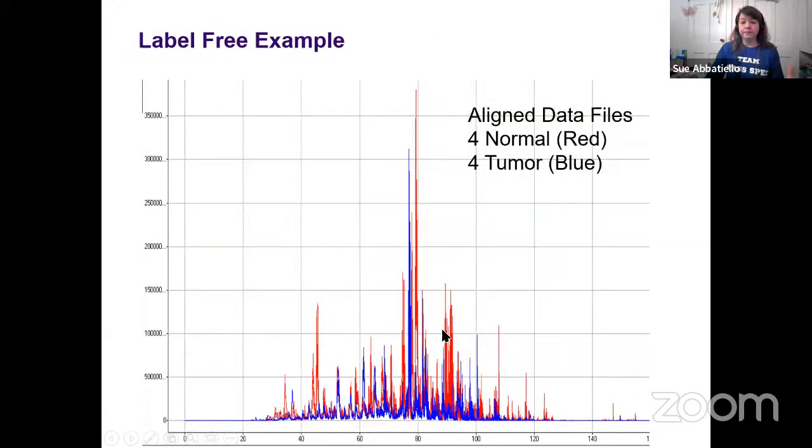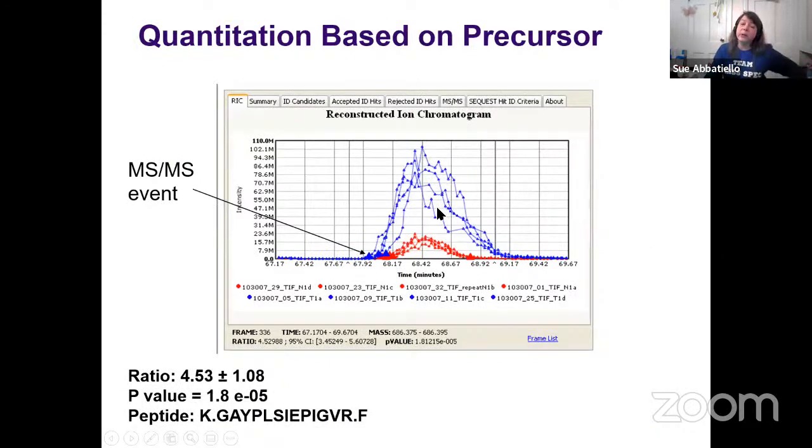So that doesn't show the alignment, but often the data can be aligned by looking at retention time and mass to charge features so that they can overlap. Once they're aligned, then you can begin to pull out individual peptide data from the MS spectra.